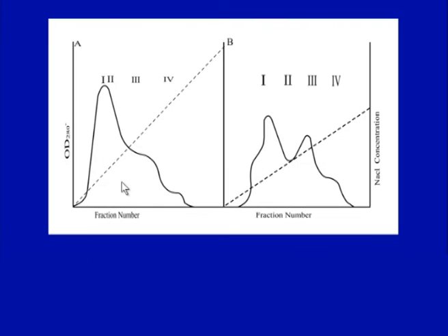the chromatographic purification has been compared for a steep gradient and a somewhat less steep gradient, and you can see that here only the first peak is very clear, other peaks are not very clear, but here you can see two peaks are separating and other peaks are visible.